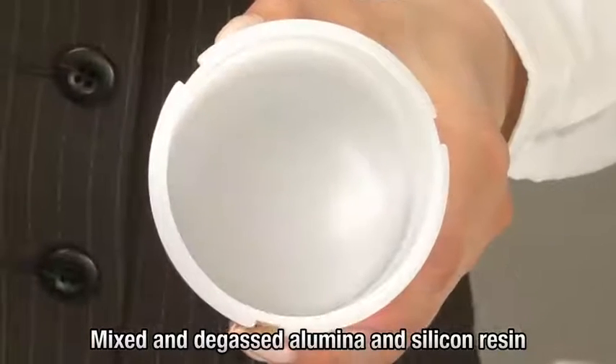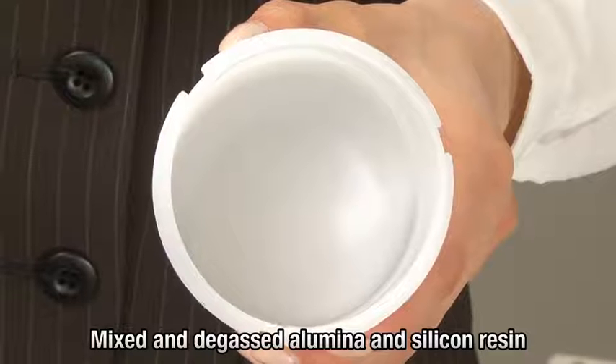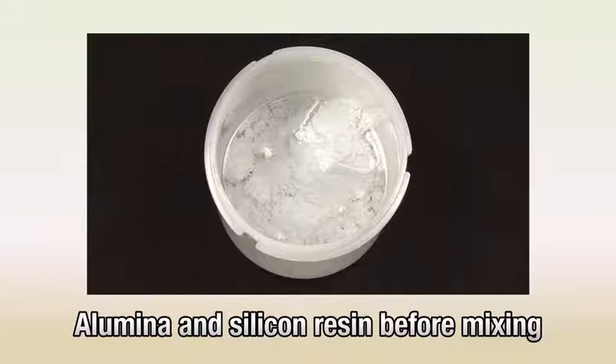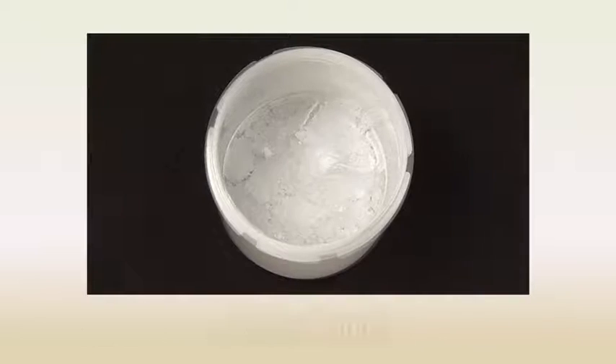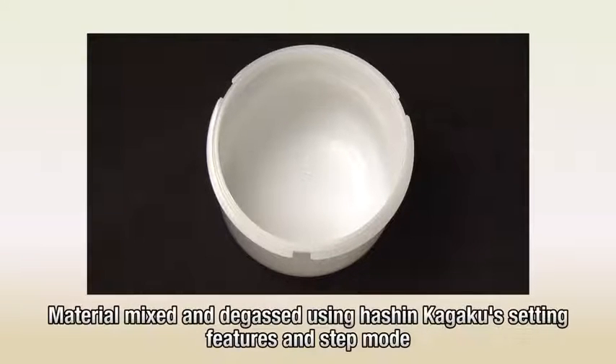Two-step processing has successfully mixed and degassed the materials. Typically, when mixed with resin, powders form lumps that are hard to break up. But with separately set revolution and rotation speeds and step mode operation, this product prevents lumping and thoroughly mixes and degasses the materials.